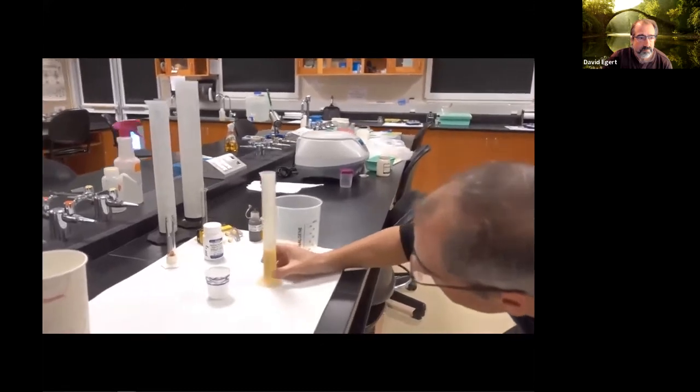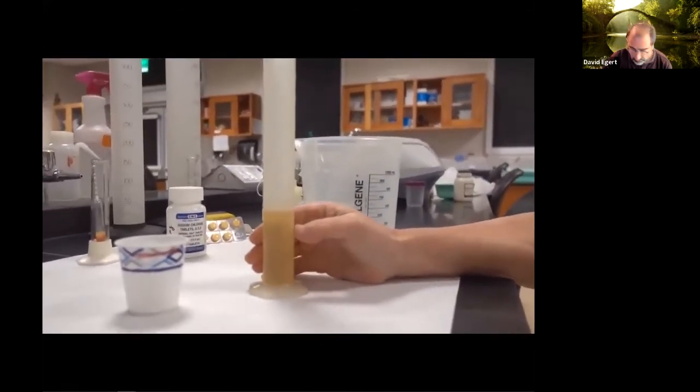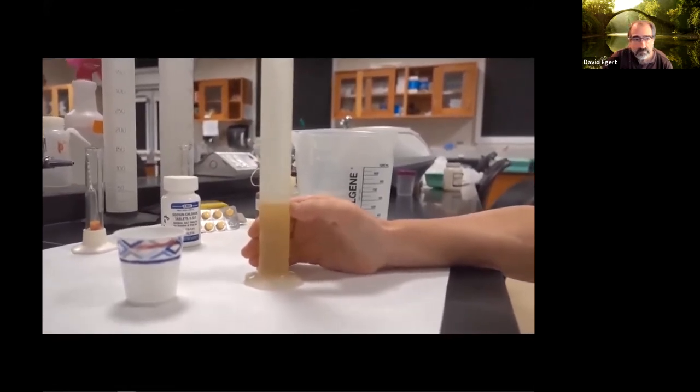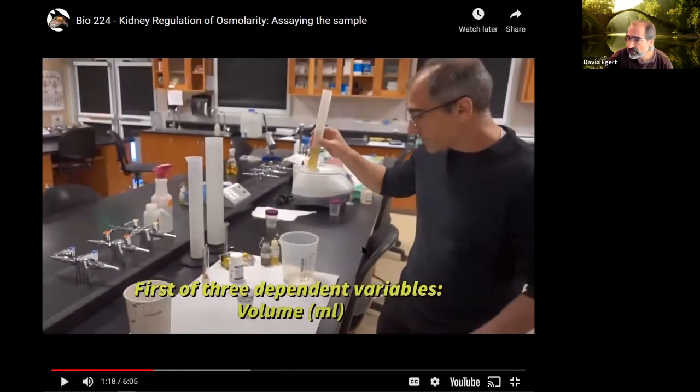And I can see it's about 31, 2, 3, 4, 5, 36 mils. Don't worry about these values. You don't need to measure these values. This is just showing how all these numbers in the spreadsheet that you're going to get were acquired.